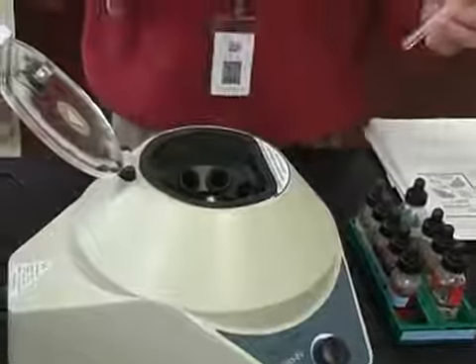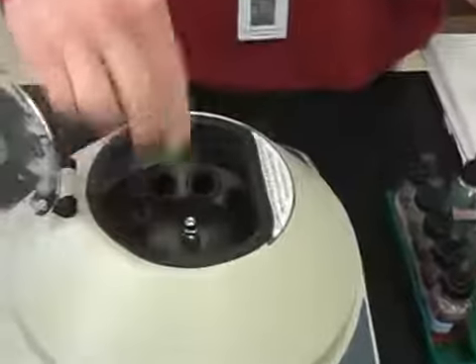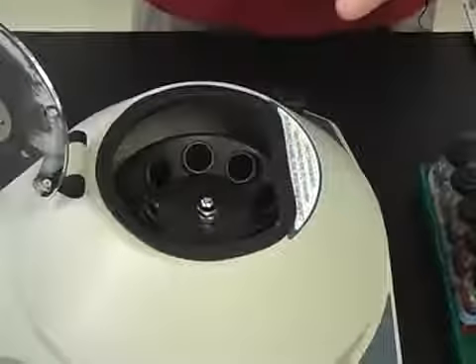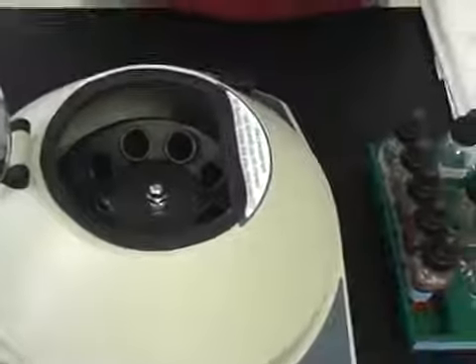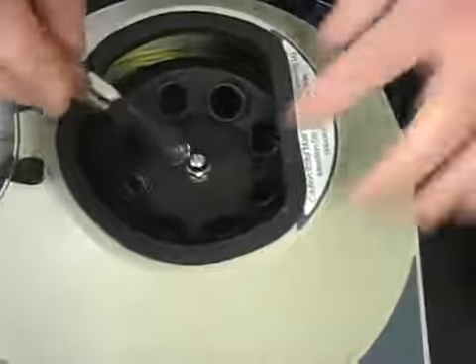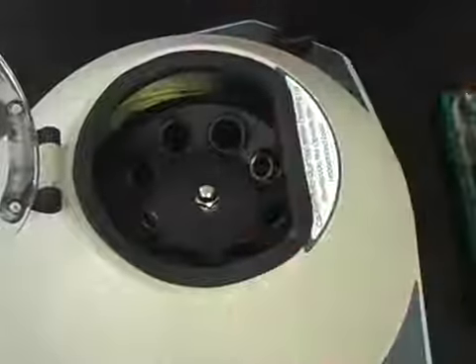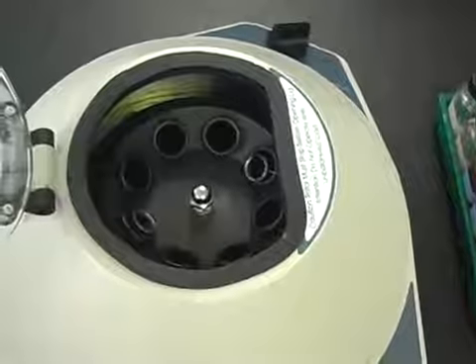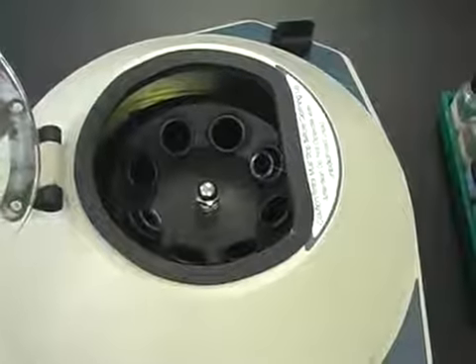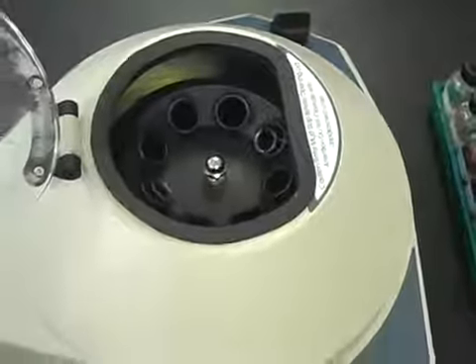And so when you load a centrifuge, make sure that you put your solution that you want to centrifuge on one side, and then add another solution, or a blank test tube with some water in it, exactly opposite of it. Exactly opposite. And if you look at the bottom of your page that we're looking at right now, it says page 124 on mine. You can see how to safely load a centrifuge.